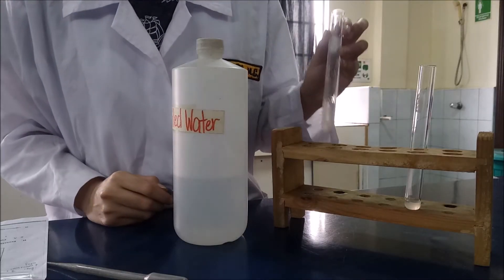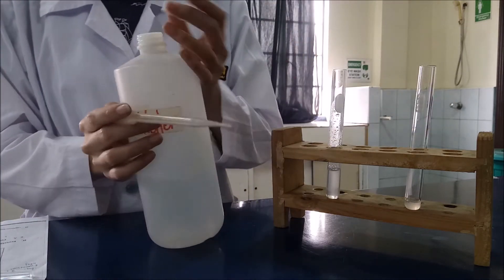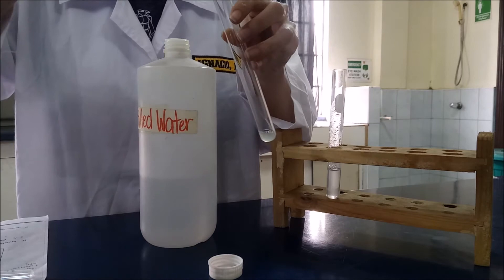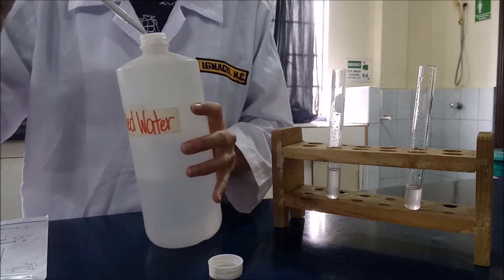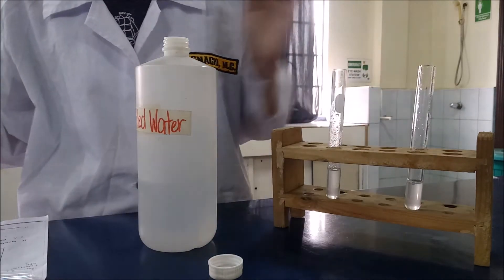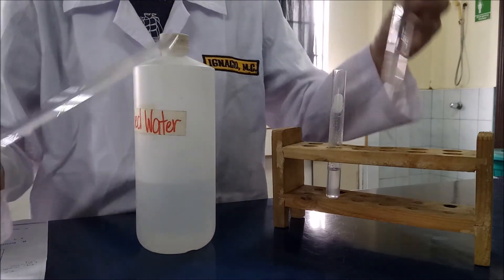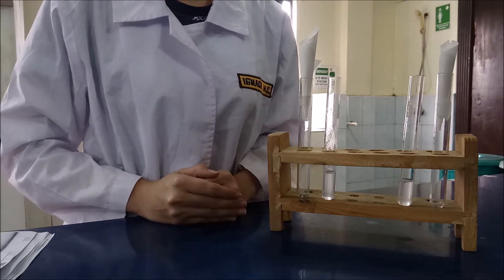So after letting test tube one cool, add 3 ml of distilled water to test tube two and stir it. Next is to filter both tubes separately by using the filter paper.